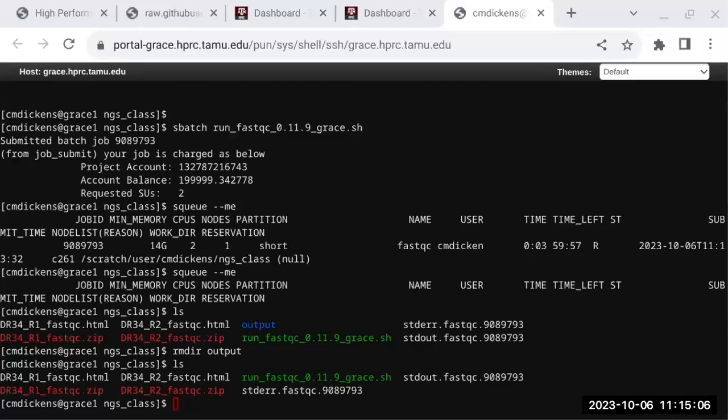Can I see those slides? You have a lot of comments. Oh, okay, command lines on the web. Yeah, so can we look at those slides so they can follow and paste those? Oh, you want to find the slides? Yeah, there are a lot of command lines that you highlighted on screen. Oh, can you highlight it from here? No, what I'm saying is you're going through the slides and at each step you highlighted some of the command lines. Can you look at those slides?